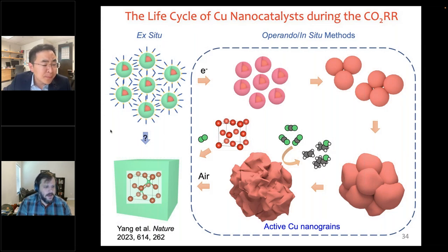Cool. And were there any considerations on local pH? Electron interaction with the electrolyte can greatly change or increase the pH where the electron beam is present.